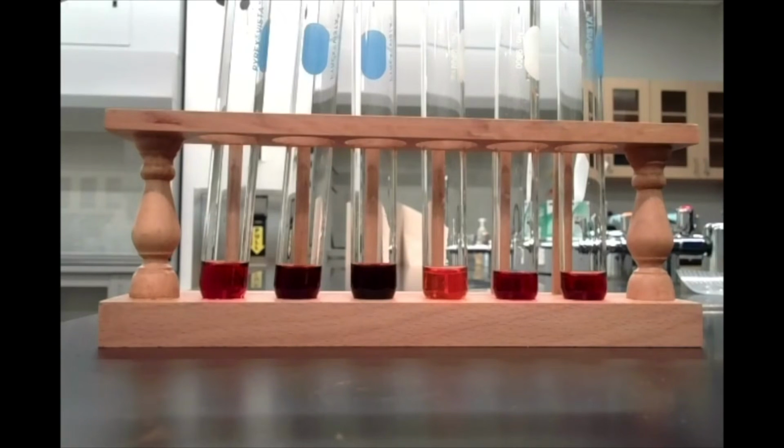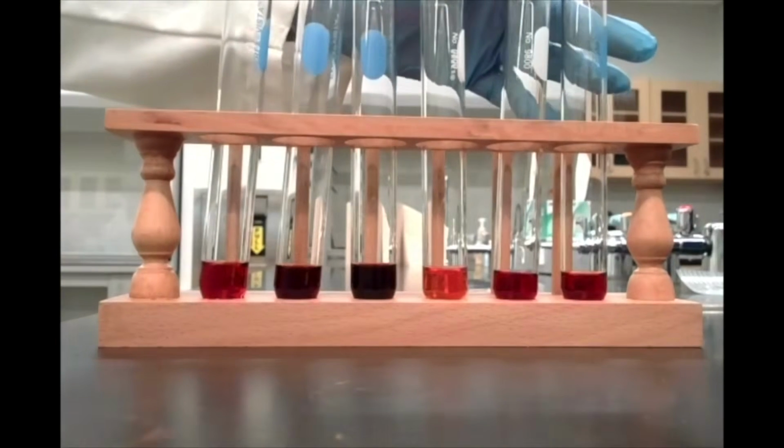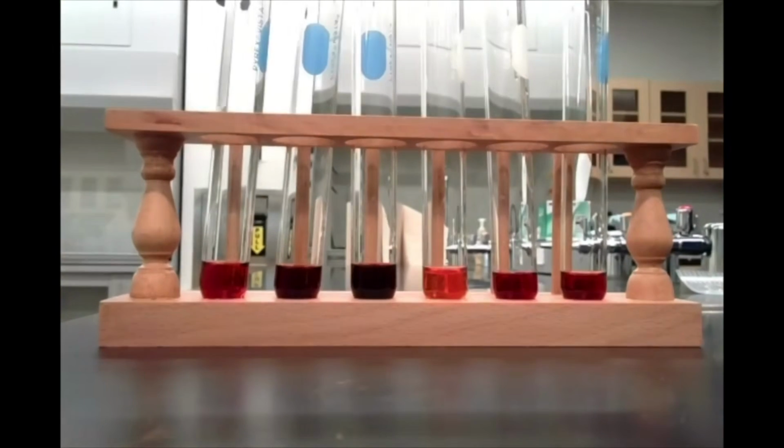So for the last part of this lab, we're going to figure out on what side of the equation we're going to write down heat. So just look at the way this equilibrium shifts in these last two test tubes once we put them in our hot and cold baths respectively, and you're going to observe how adding heat changes the equilibrium and how removing heat changes the equilibrium. Okay, and that'll tell you whether heat's on the reactant side or the product side.